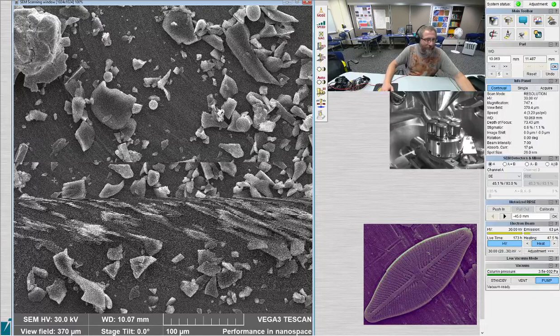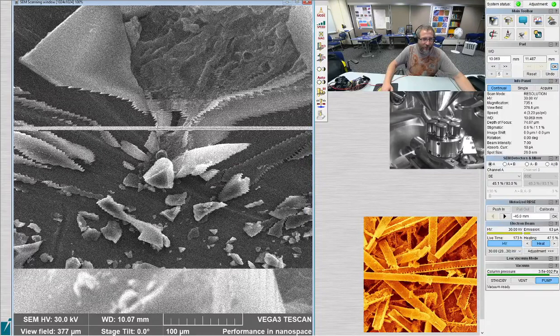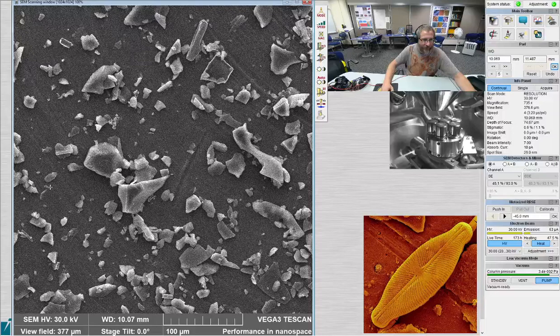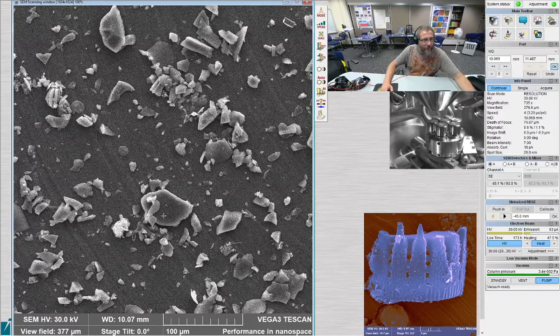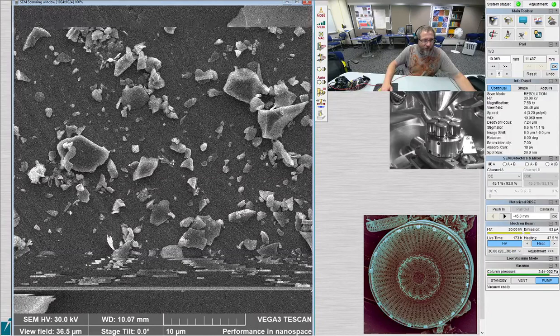So I just put an undiluted sample into the SEM. That actually means that all the samples have pretty good concentrations. Then I thought, well, maybe we'll find that little weird thing again. But even if we don't, we should get some pretty good views of whatever else is here through these. I've been seeing this the other day on the stream on Monday. We looked at these samples, but a different set, like 1 and 7, and I'm on number 6 on the carousel, and we've been seeing this thing.